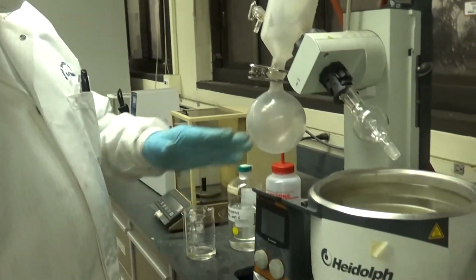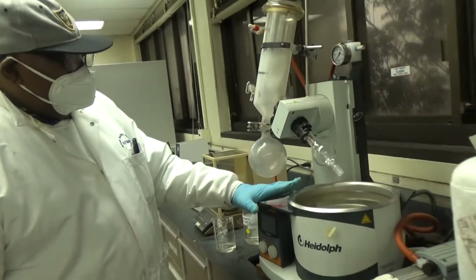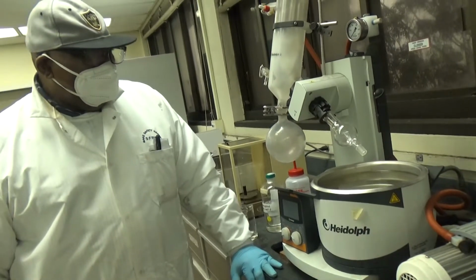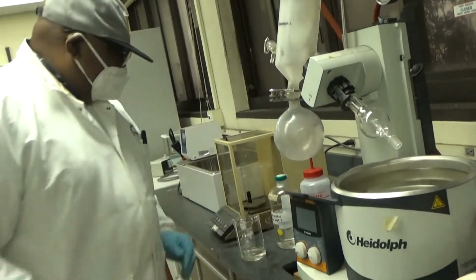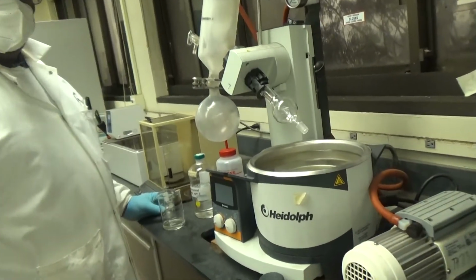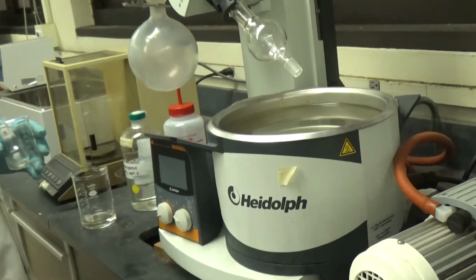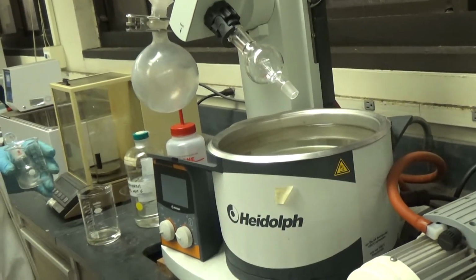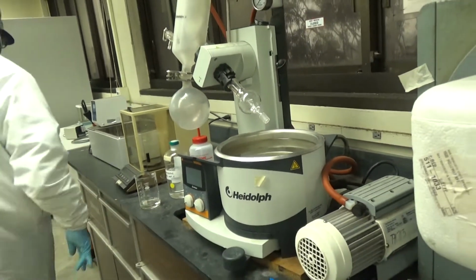So these instruments are expensive. In the past, students did evaporate with solvent at the benches, and that was not good. Since a couple of years, we have rotary evaporators, 2 in each lab. They're about $10,000 each, or maybe 15,000, a little more. It's an essential piece of equipment in organic chemistry.